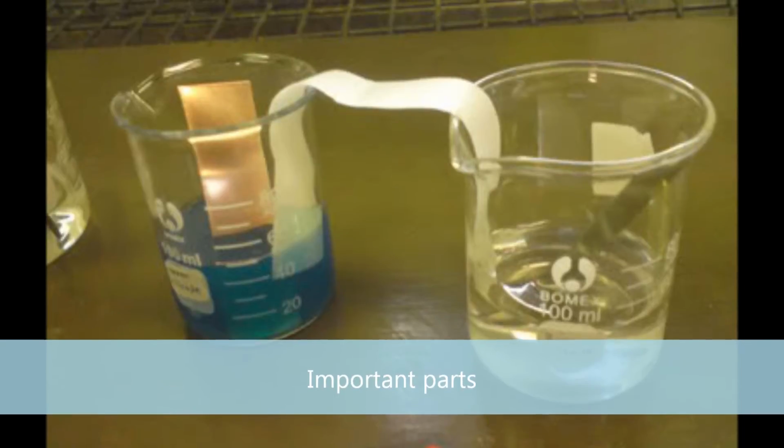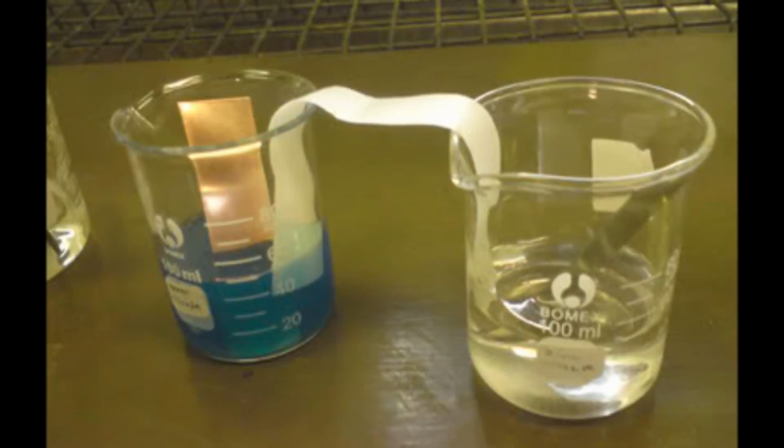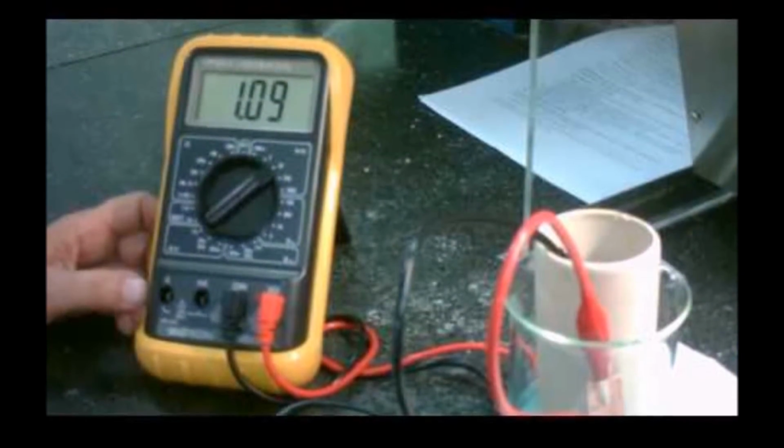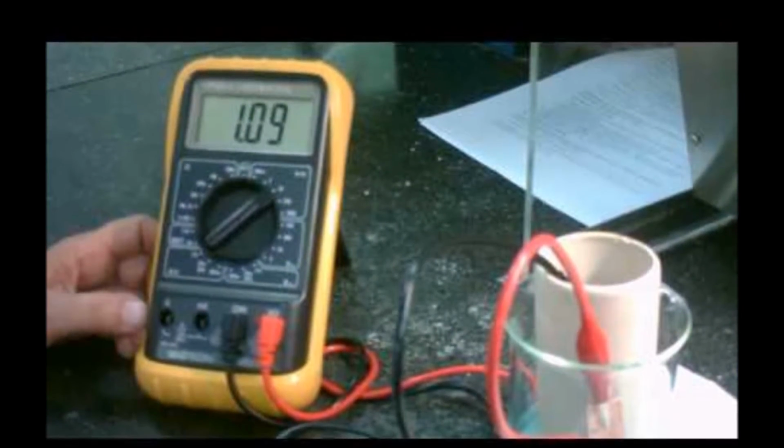The important parts of these experiments were to use a salt bridge to permit the flow of ions from one container to the other. Another important part was that we need to check the voltages in the correct order and to know what reactions were occurring.